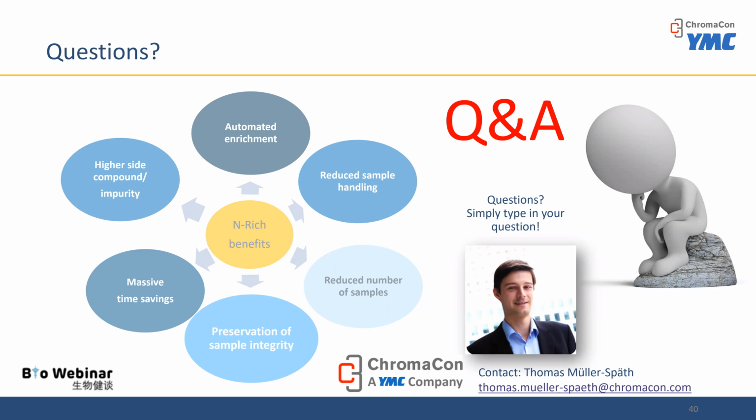Very good, thank you. Next question, is the process scalable? Yeah, so that's a good question. It's intended as a tool in analytical departments, right? So to produce certain milligram amounts of isoforms or other side compounds. So we actually think that it doesn't need to be scalable. It's certainly not a manufacturing process because it doesn't reach a steady state. So it accumulates product inside all the time, right, or compounds of interest all the time. So we consider it really a tool that is in product development.